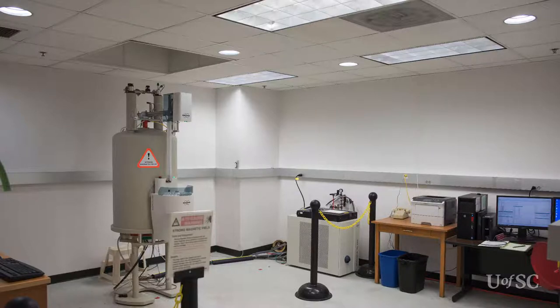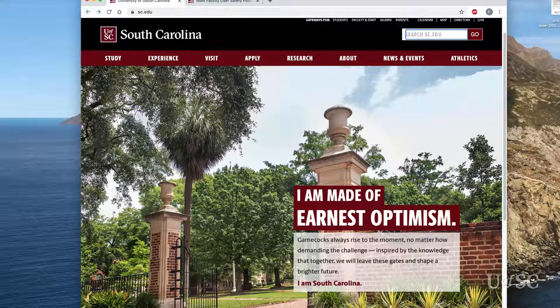Remember the NMR facility is considered a chemistry laboratory, so health and safety rules apply here. It is important that all users understand the safety rules specific to the facility before they access the lab. Users can view these rules and other useful information from the facility's web page.